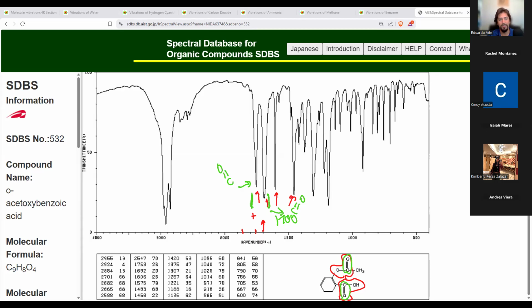Does that make sense? So a question that I might ask you on a quiz might be, okay, there's two carbonyl peaks. Show me where they're at, and tell me which one is the top carbonyl and which one is the bottom carbonyl. Something about them lowers their wave number. And that's where you would have to sit down and think, oh, okay, what causes wave number to go down? And so now you can tell me which one is the top one and which one is the bottom one. So yeah, you can make these kinds of predictions once you understand the stuff that we talked about earlier.